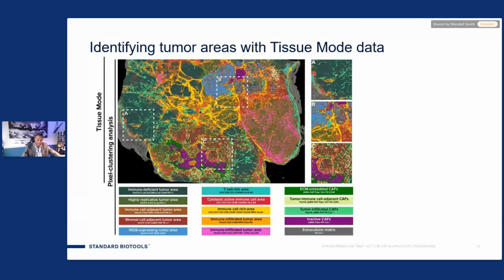And you can utilize those heat maps to sort of figure out which cluster gives you the best information for your particular area of biology. And once you select those clusters, you can then label whatever those clusters are. Let's say there are 2 clusters that are similar and you want to merge them. It gives you the capability of merging that. So you can label everything in your experiment that you stained with the heat map, just like you would pretty much with any other technology.